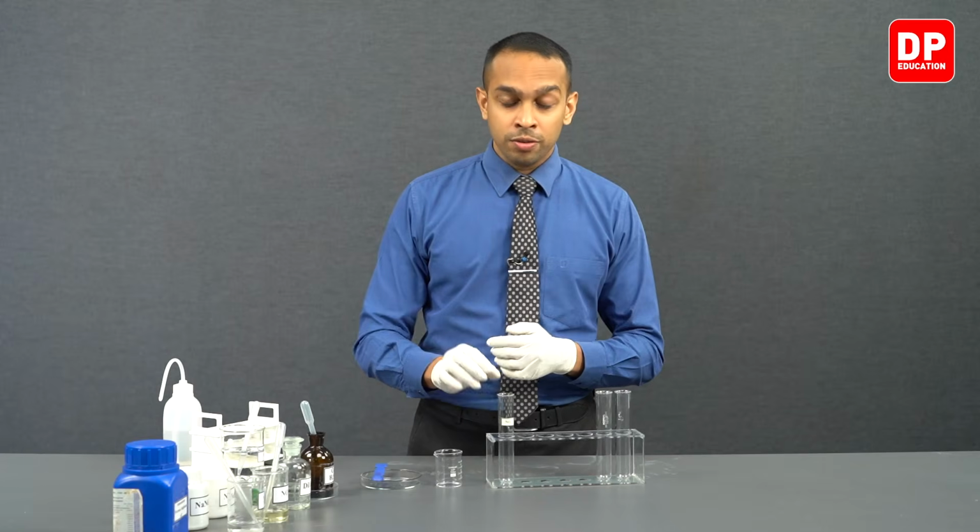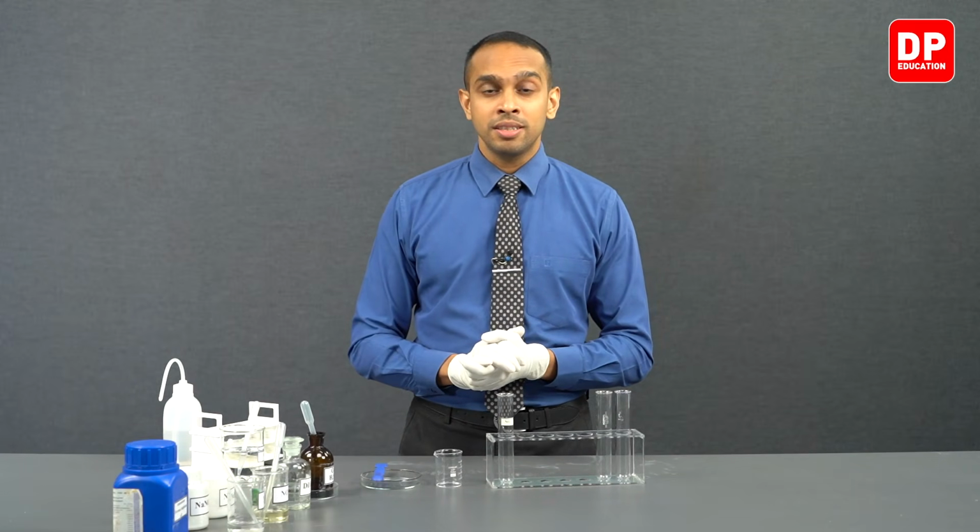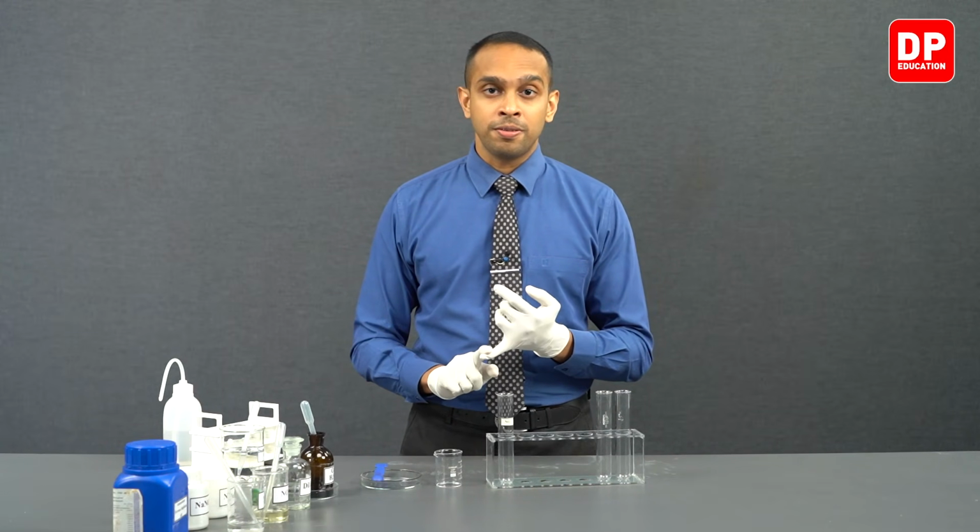So for this test we will need a saturated solution of FeSO4, or in this case we have ammonium ferrous sulfate.